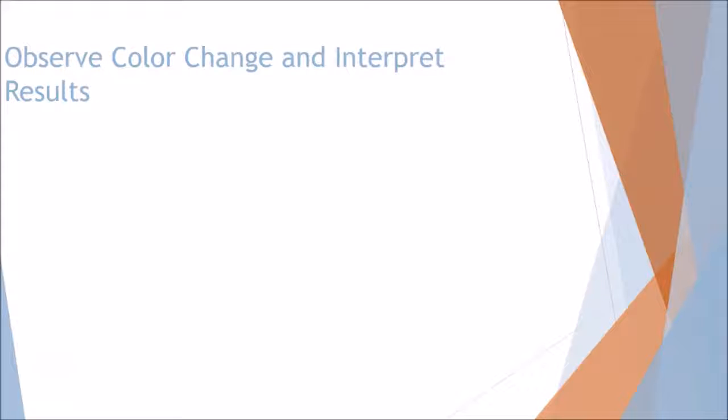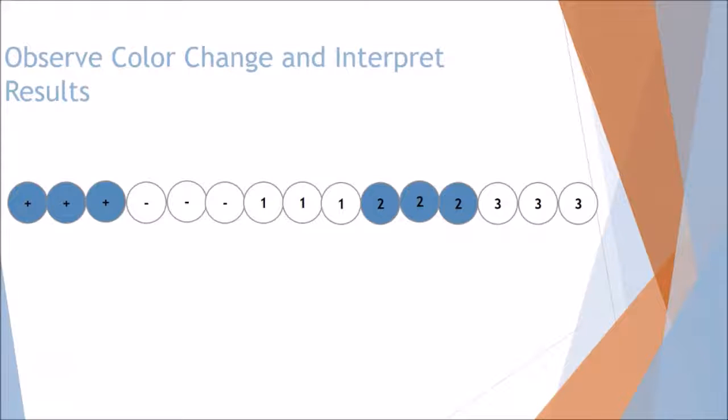So to interpret the results, we have to observe a color change, and here is a simulation of what it would look like in the indirect ELISA assay.